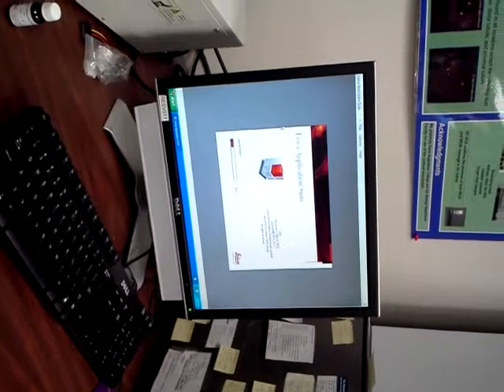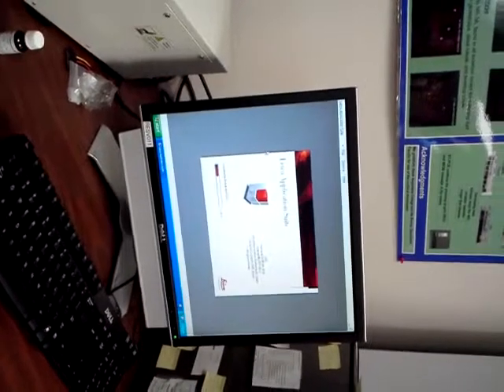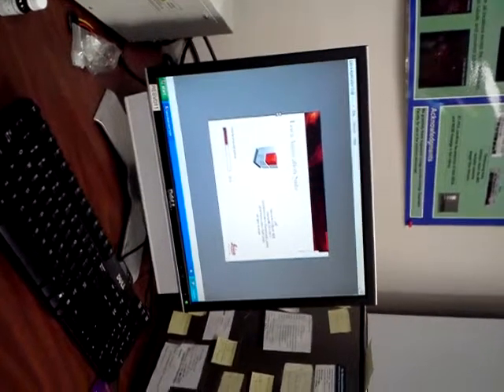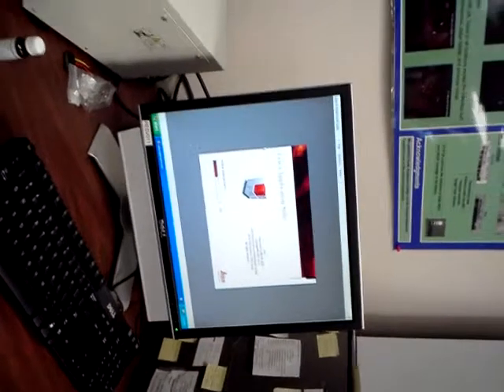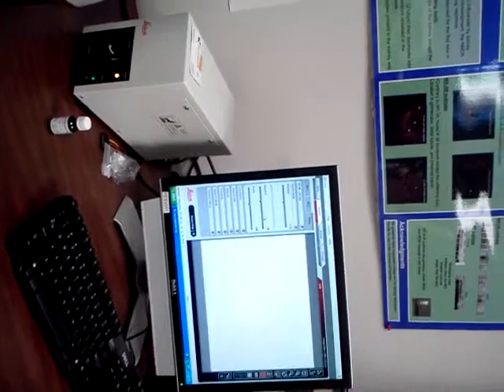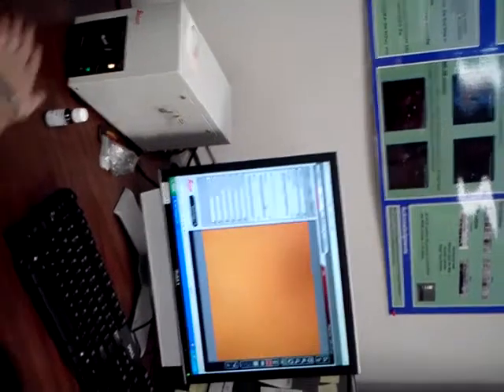So you can be looking through bright field and then switch over to fluorescence and then bright field, fluorescence, as you're trying to figure out where you want to go in the section. Is that what that shutter is? It's very fast, yeah. Is that shutter TL? Oh no, that one, the bottom one. Bright field, fluorescence. Bright field, fluorescence. And then you have the shutter on, obviously, huh?